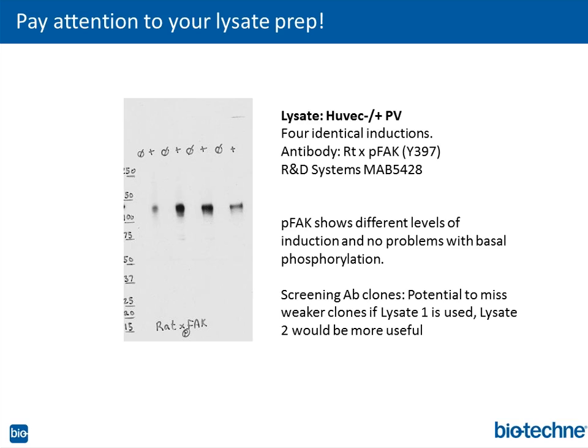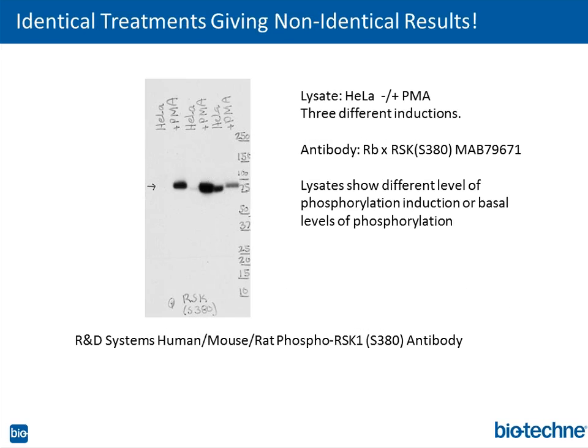Another example, quickly, this is HeLa cells, PMA treated. Again, same conditions, just more data to reemphasize the fact that identical treatments do not always give identical results. Pay attention to your lysates.